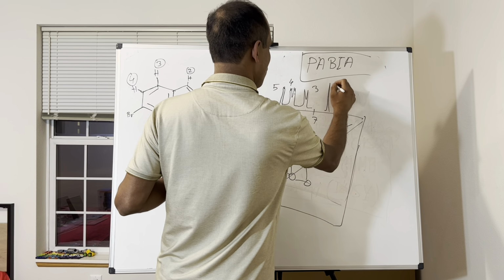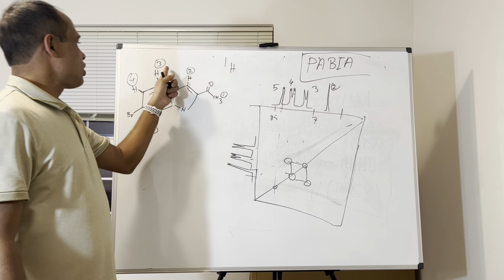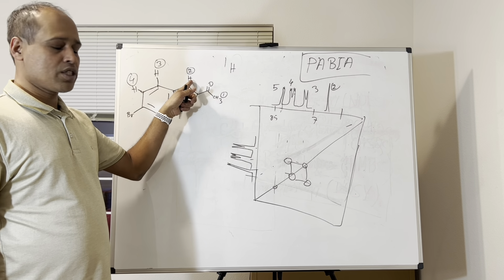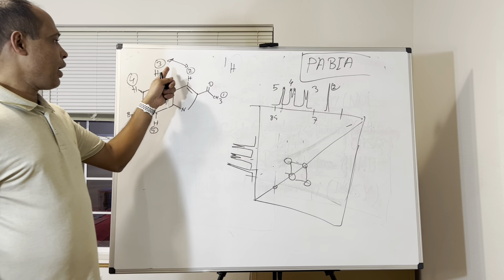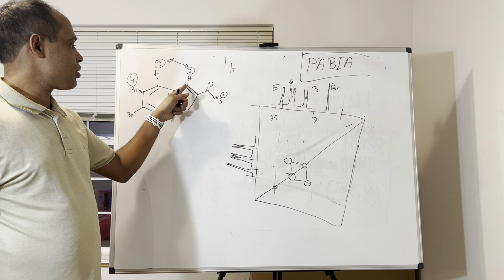So this is 2, right? And now if you take the NOESY, the vinylic proton will show a cross peak with this 3. So then you can say, okay, this 3 is next to this vinylic proton because they are correlating through space, not through the bond. Okay, so space. So that 3 is definitely on this benzene ring, close by to this indole ring.